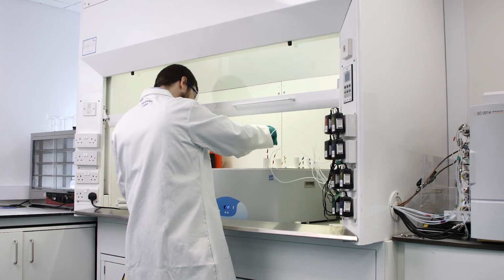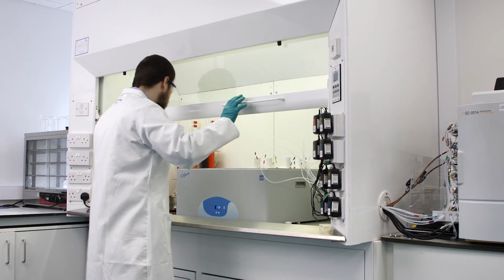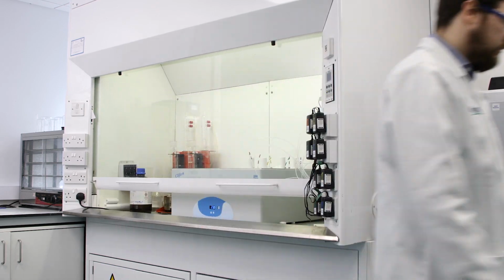Hello, my name is Alexander Dunn and I'm what's known in Ansell as a technical expert. I work within the Ansell Chemical Guardian department and it's my job primarily to use the data generated from this lab and others within Ansell to be able to find the best products suitable for our customers.